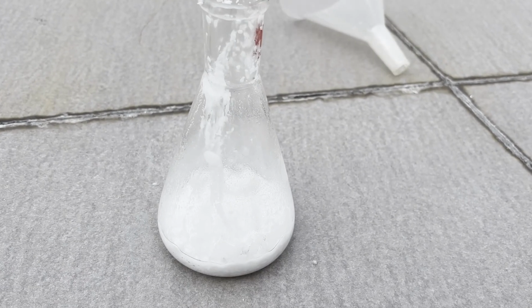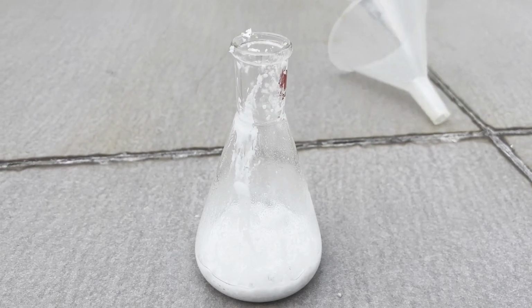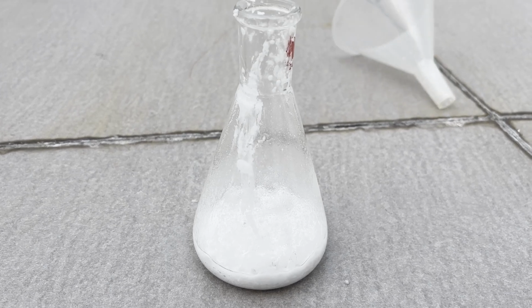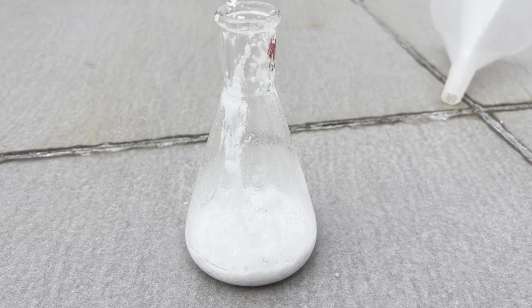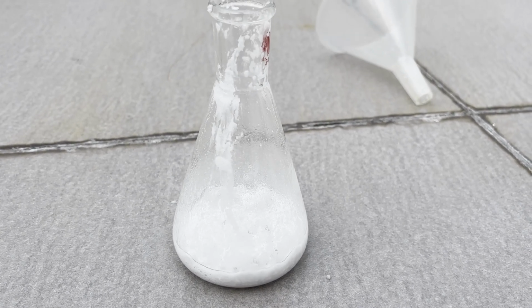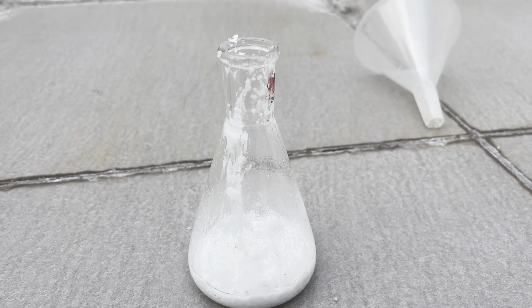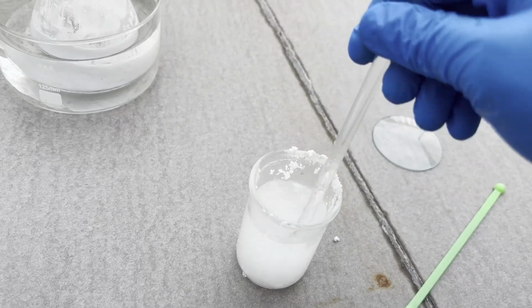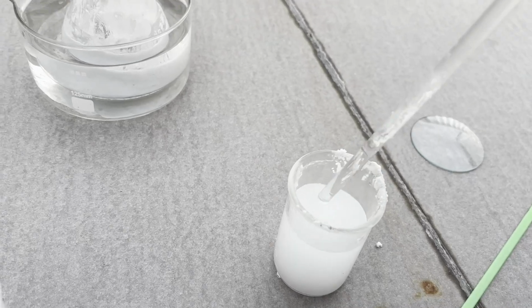After the N-butyl nitrite is done, the other main ingredient, hydrazine, is prepared. This part can be completely skipped if you have access to 80% hydrazine hydrate, but obviously that is nowhere close to being domestically available. If you have some luck, you may find hydrazine hydrate as liquid reducing agents from precious metal refinery sellers, but be sure to ask them what the specific contents of it are. On the other hand, hydrazine sulfate is much easier to buy and to make from domestic reagents such as urea and bleach, with the additional advantage of being non-volatile, so it is chosen as the source of hydrazine.